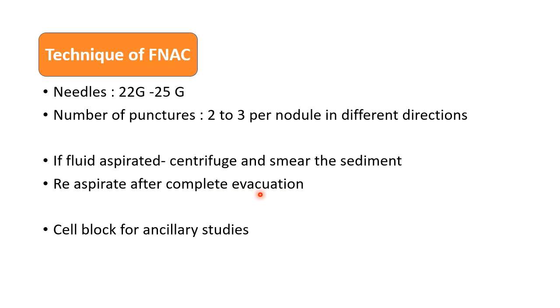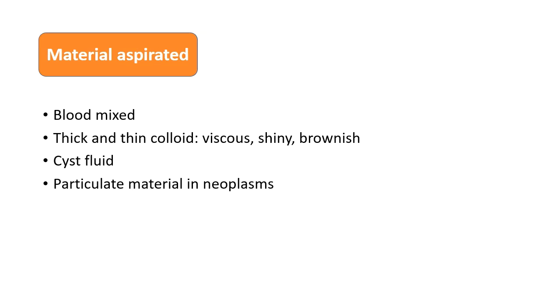If fluid is aspirated in FNAC, we should centrifuge this fluid and then take the sediment and smear it on the slides. In case there is a residual swelling after we have aspirated the fluid, re-aspirate it, and after complete evacuation, re-aspirate it and then again smear the residual material. In case of suspected malignancies, we can take a cell block for any ancillary studies.